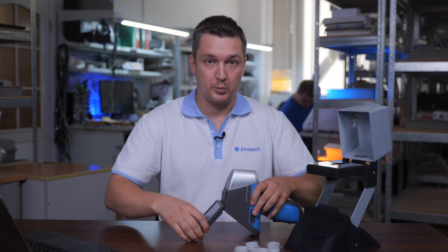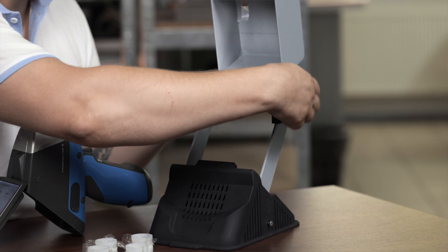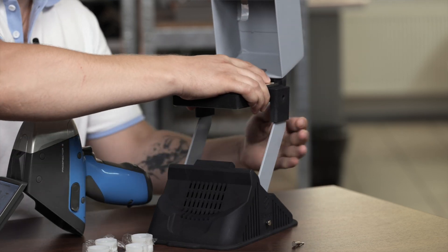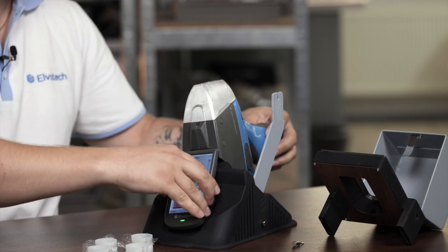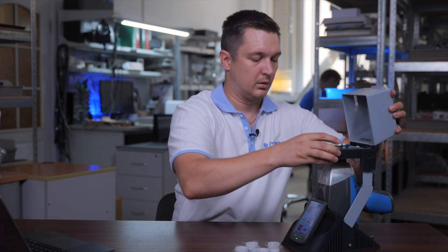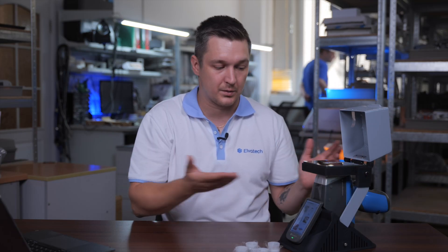So before we begin the analysis, we need to place our analyzer in the lab stand. We just unscrew these two screws, place the analyzer, and cover it with the measurement table. As you see, we have assembled it very quickly – just 10 seconds.